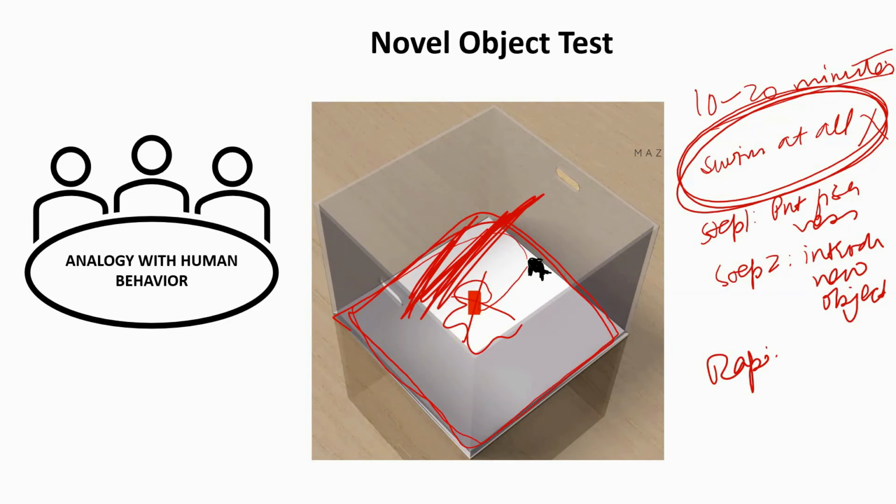Okay, it does come with a timeline, and from my experience, 20 minutes is enough. After that, the fish also gets bored because the object is not moving. Right? So the subject doesn't feel that it is a predator. A predator always moves. All right. So if in place of this, you had brought some fish that can eat zebrafish, the fish will never rest, it will keep on running here and there.